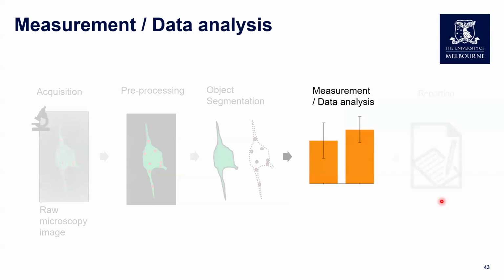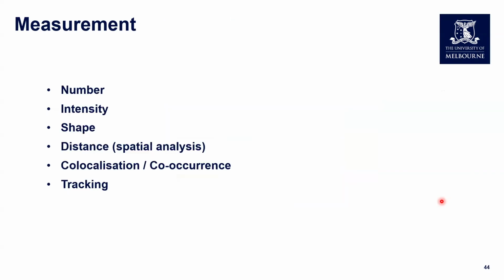Right. So now we are at the fourth stage of bioimage analysis, which is measurements. These are the standard measurement categories, and I will introduce each briefly on the following slides.